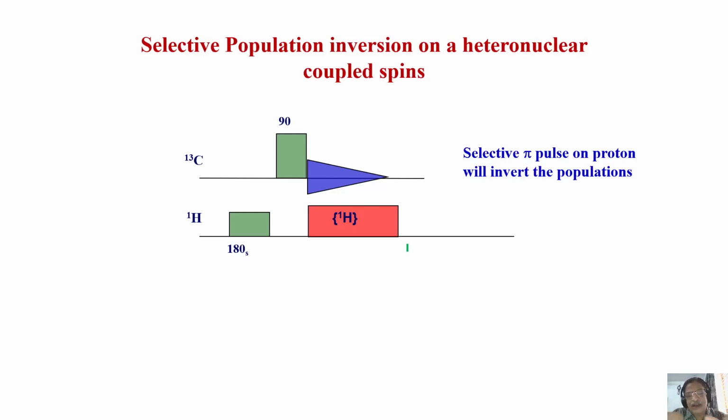When you have antiphase components of the multiplet and immediately after that you start decoupling, the vector addition of the opposite signals is such that the gain is nullified. That's what we observed. You don't get the gain. Whatever we have gained is lost. But that is not our aim. Our aim is to maintain the gain and at the same time do decoupling, otherwise the spectrum becomes complex. Our aim was to get a decoupled carbon-13 spectrum while making sure the gain is retained.